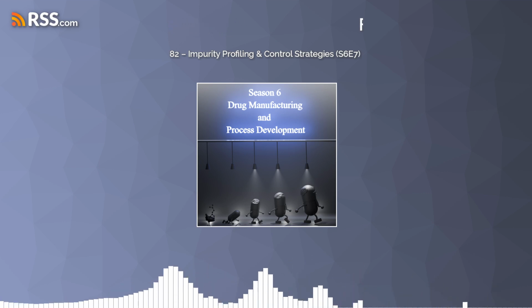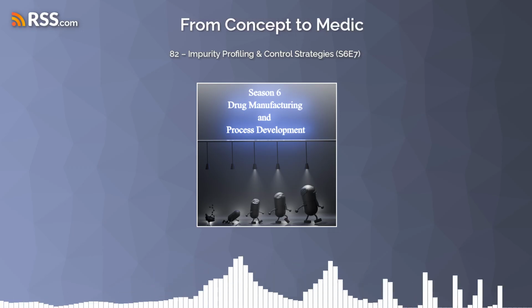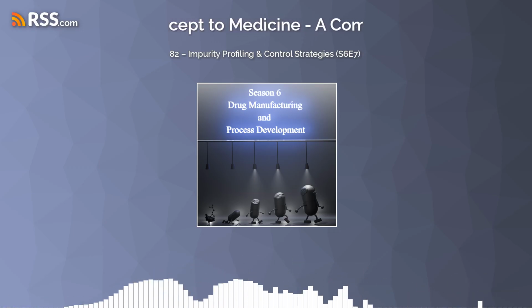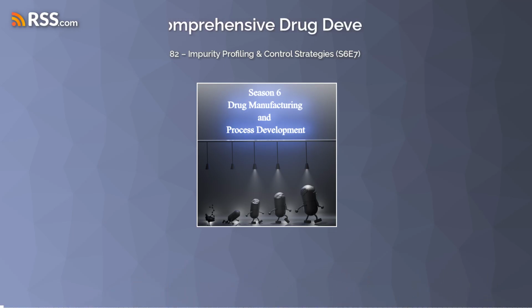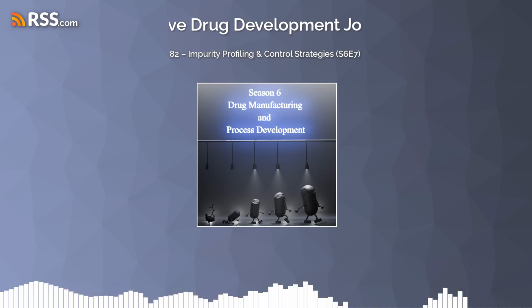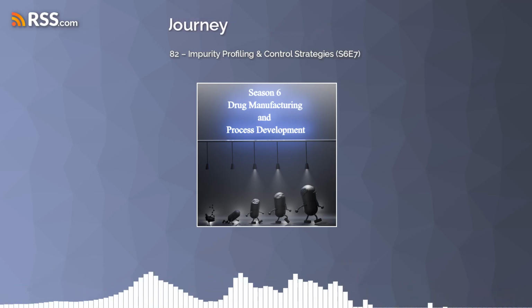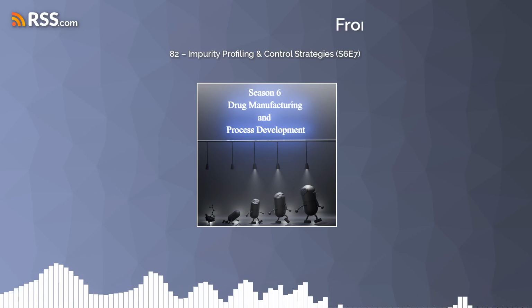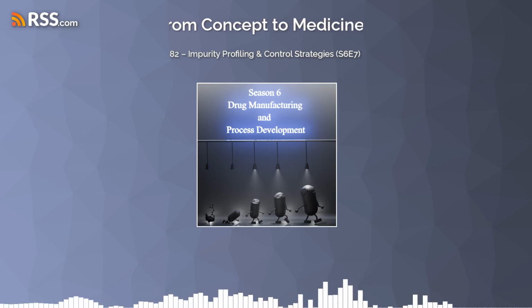One of the sources mentioned that for calcium detection, a reaction cell using ammonia is way more sensitive than a collision cell with hydrogen, simply because it does a better job at eliminating that pesky argon interference. So it's not just about, does it work? It's about, does it work best for this particular analysis? Exactly. Wow, it's amazing how much complexity goes into just figuring out what's in these meds, even at that tiny scale. It's mind-boggling for sure.